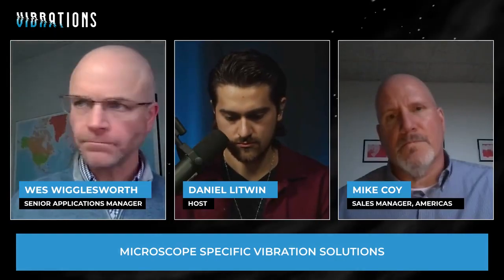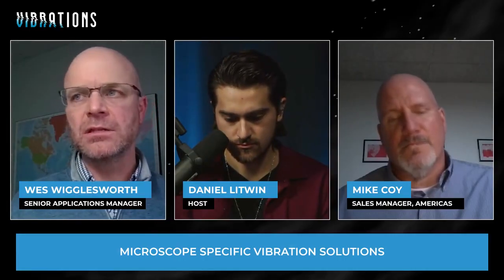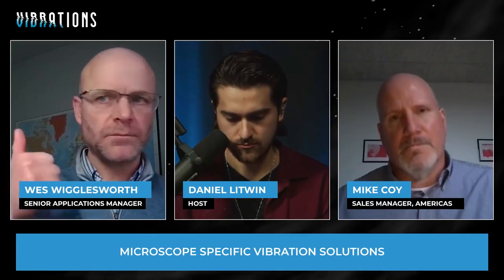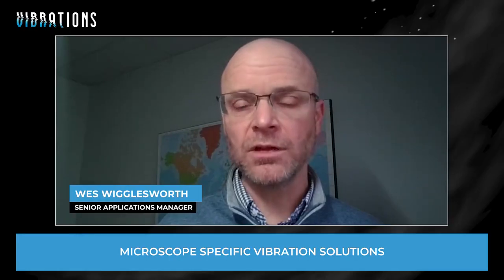And once we worked with him and installed the right kind of base under the microscope, he was no longer affected by the train. And the nice thing about that is the throughput with that tool increased, I think, by a factor of 4. The usability of the whole lab was significantly increased. So it was really beneficial to this particular, not only that one tool, but the whole lab greatly benefited from addressing the problem correctly.